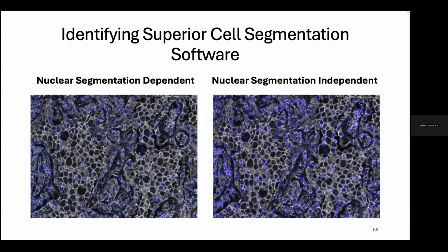And then from there, you will tell the algorithm what your marker is, at what intensity you want to recognize that as a true membrane signal, and then it will search from the middle and expand out looking for that signal. And sometimes it fails, it does not quite get that far, or it goes too far and it surpasses the threshold that you set, and that can be quite frustrating.